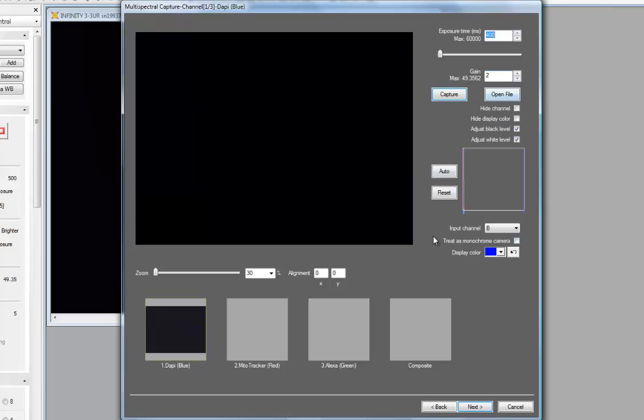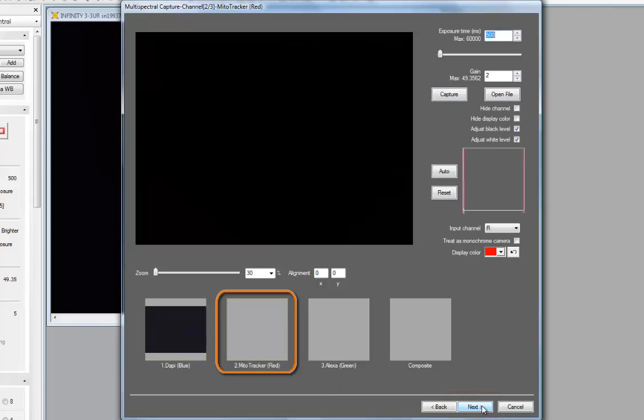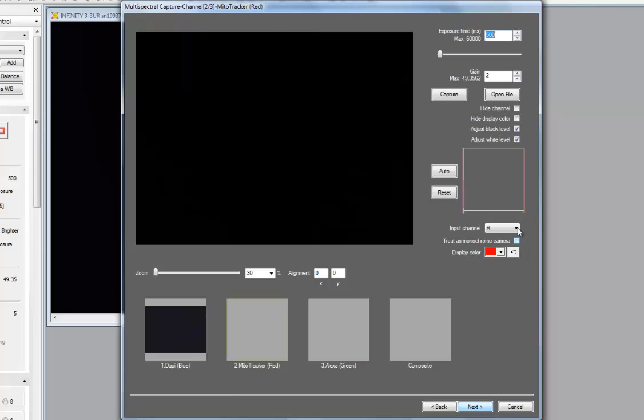So, to proceed to the next channel for acquisition, I can either click the next button at the bottom, or I could click on the thumbnail. So I'll just use next. It's now taking me to my second channel, which produces my red output. My display color choice for MitoTracker red is defined by this channel setting as being red, and I can make sure that my input channel off my color sensor is also set to red, as that will give me the strongest response from the sensor.